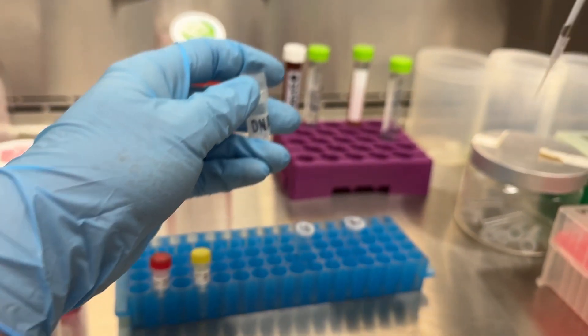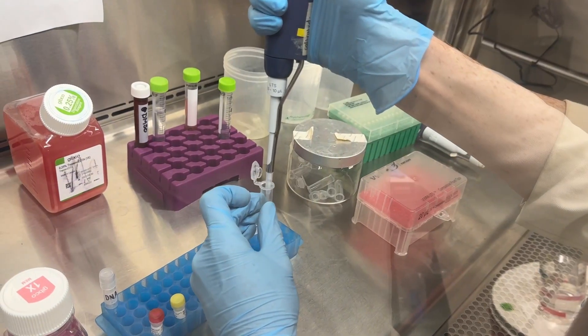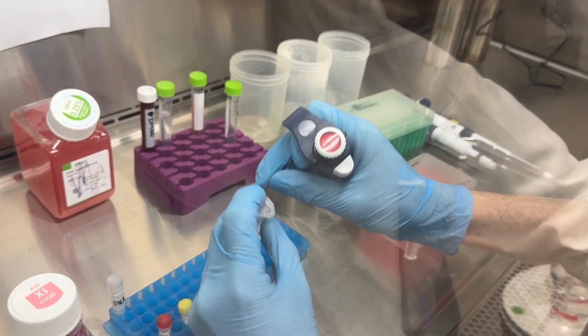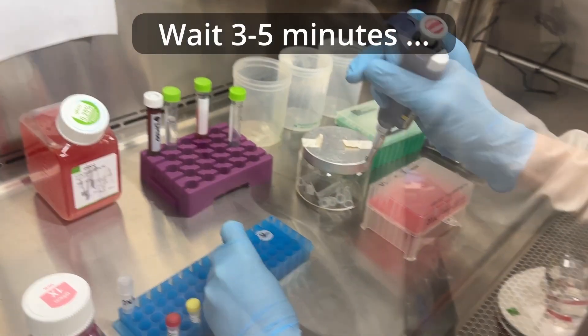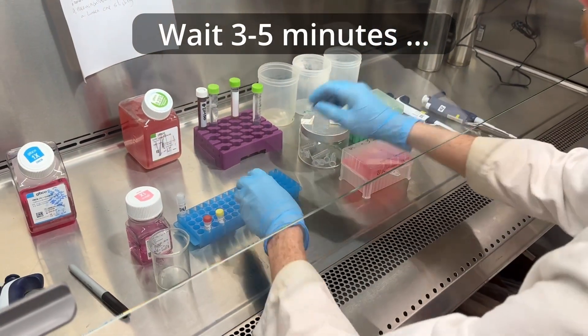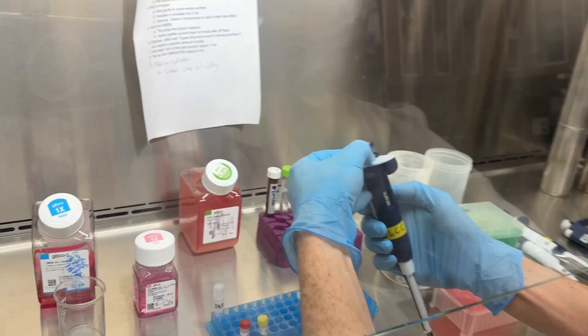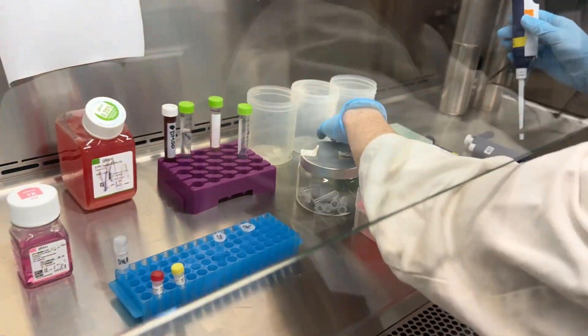Here he's adding all the reagents into the tubes — add the appropriate amount of DNA, one microgram in our case, pre-calculated according to your DNA concentration. Then just a little tap to make sure everything settles on the bottom, and then we wait three to five minutes. At this point the reagent is basically just getting active.